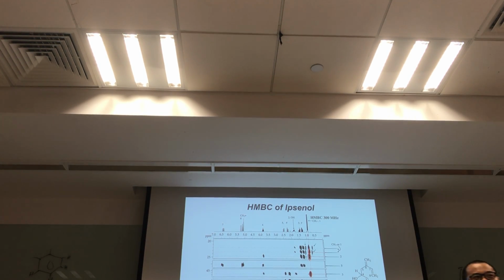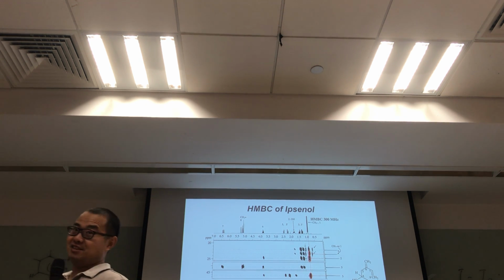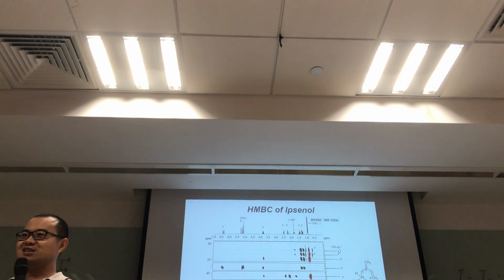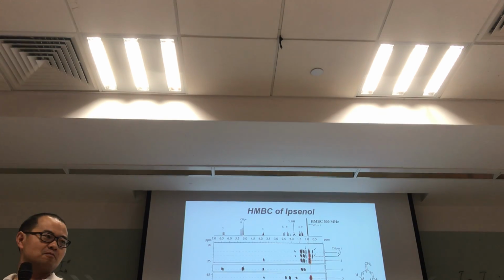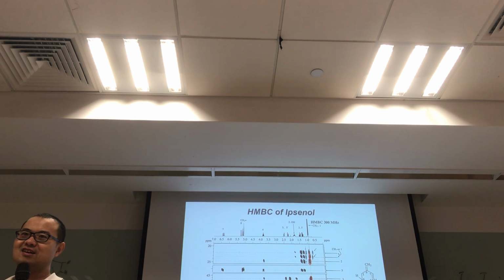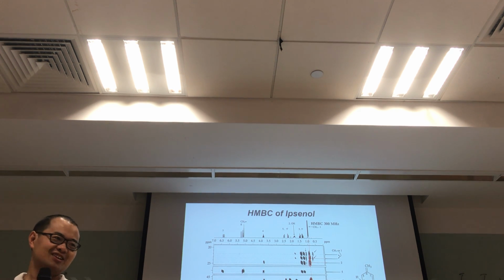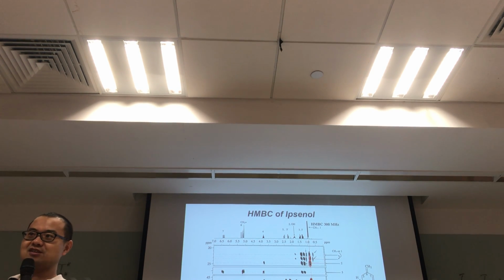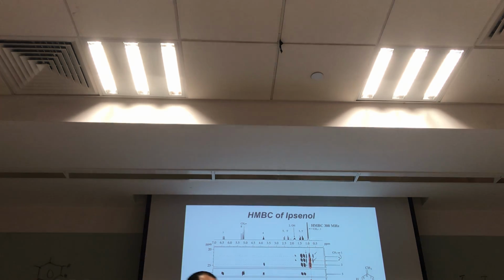Now by this, anybody can tell what's the very obvious difference between HMQC and HMBC. Unless you know the difference, then you don't know how to use it.